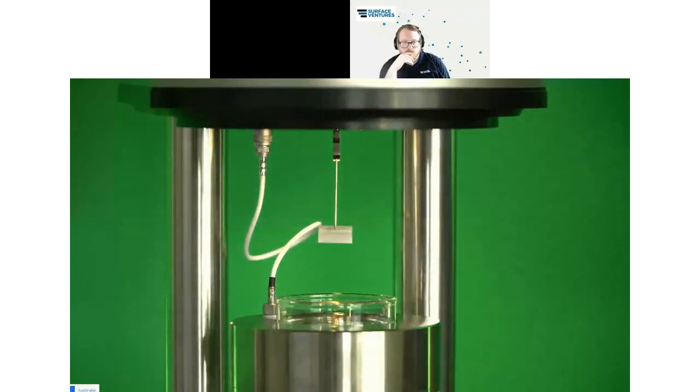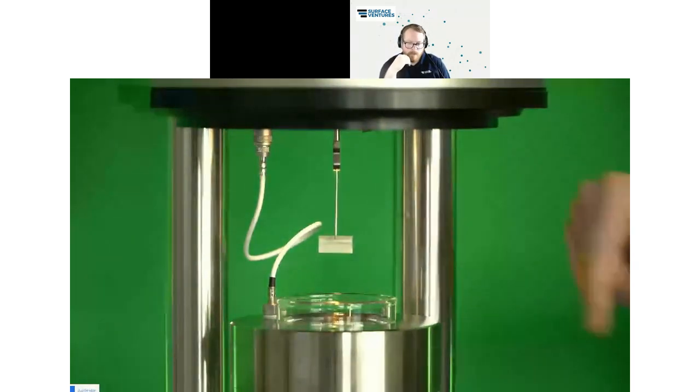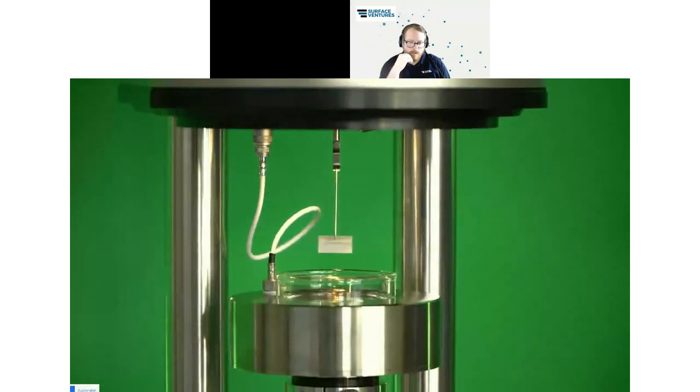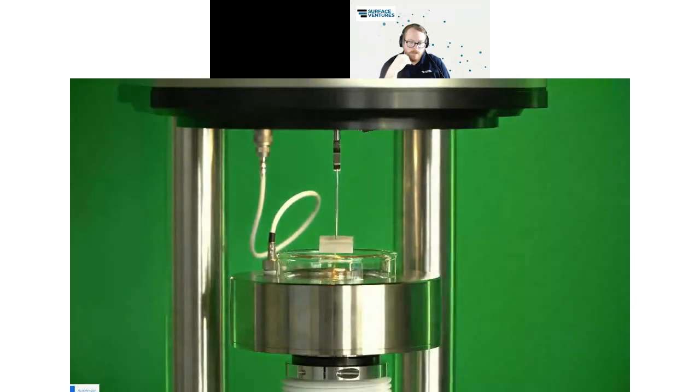So before I start the experiment, you can see I have now opened the clamping. So now the device is active. And now I can use my touchpad and I can raise the sample vial a little bit up. So now we go over to the computer and then we run the software and start our measurement.